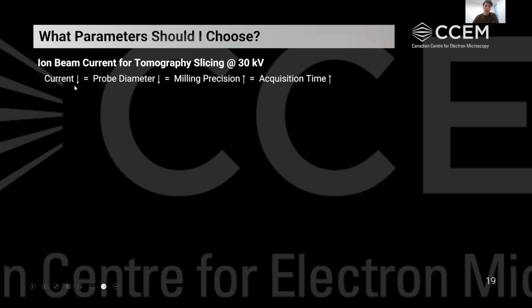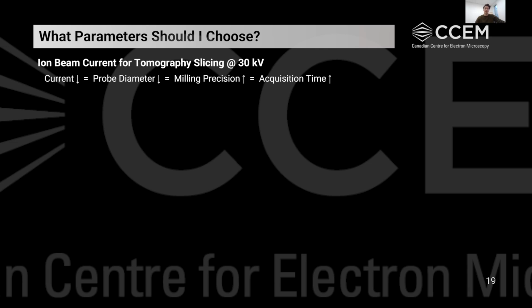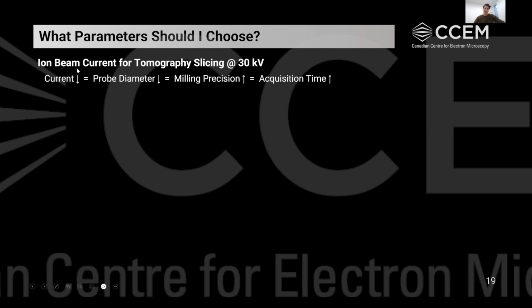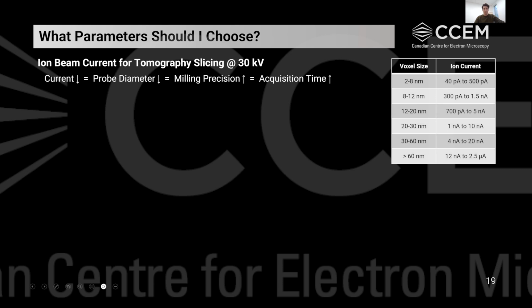So with lower currents, we get lower probe diameters, which means we get higher milling precision, but that takes longer to acquire, longer to perform the slicing operation. We have fewer incident ions, which means we have to expose for longer times to achieve the same depth. Alternatively, if we use high currents, we have a higher probe diameter, meaning we have slightly less milling precision, but we have overall shorter acquisition times.